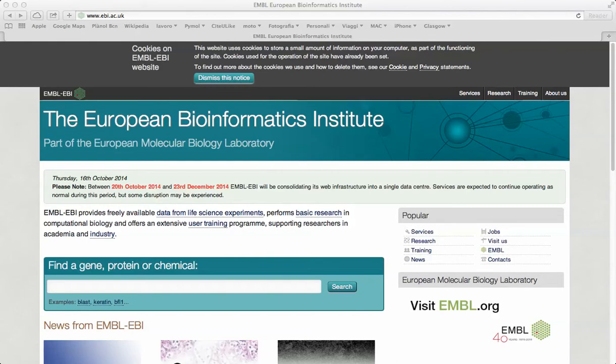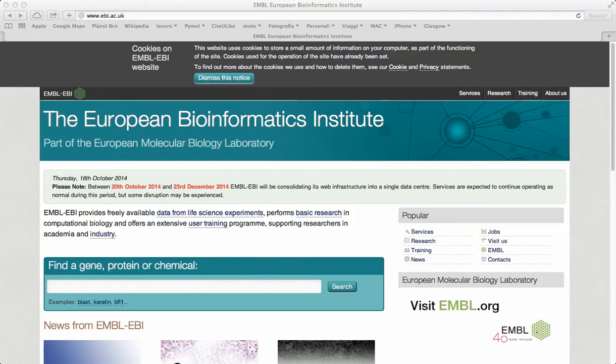Pairwise sequence alignment methods are used to find the best matching local or global alignment of two query sequences. In this exercise, we are going to construct pairwise sequence alignment using the web server of the European Bioinformatic Institute.